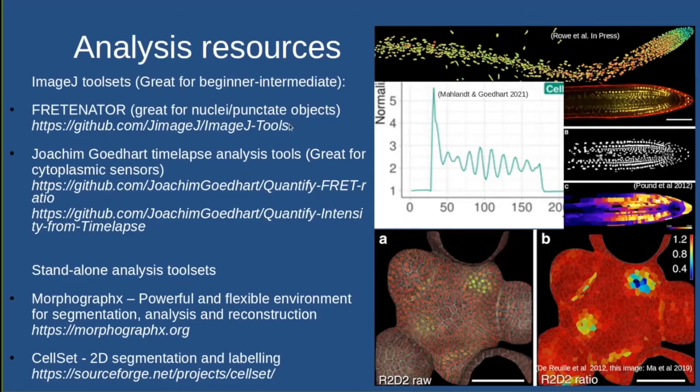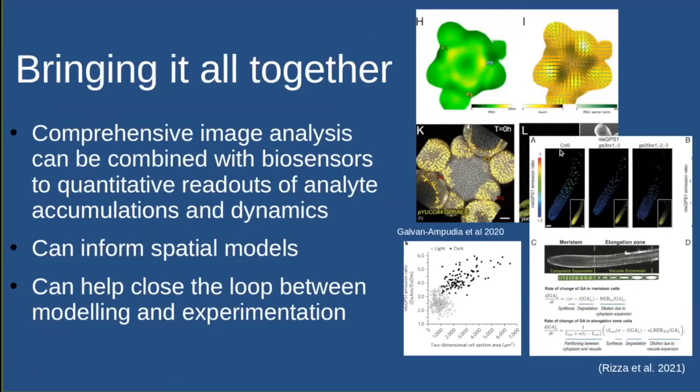And I would really advise you to investigate the best ways of analyzing your images, because once you can perform this sort of in-depth analysis, get quantitative spatial readouts of accumulations, dynamics, and the like, you can use these to inform spatial models and help close the gap between modeling and experimentation.